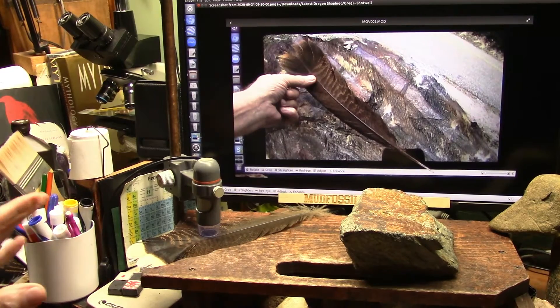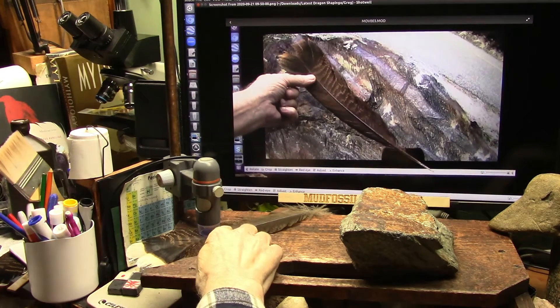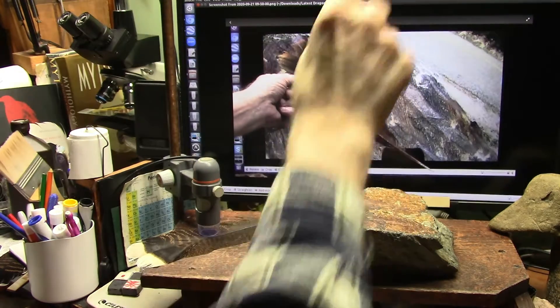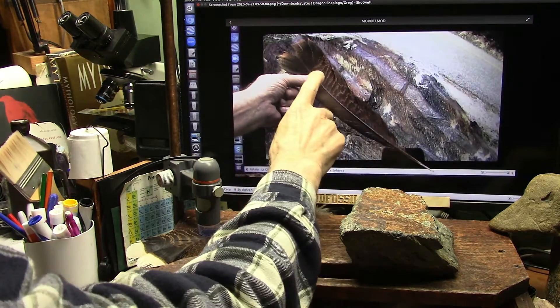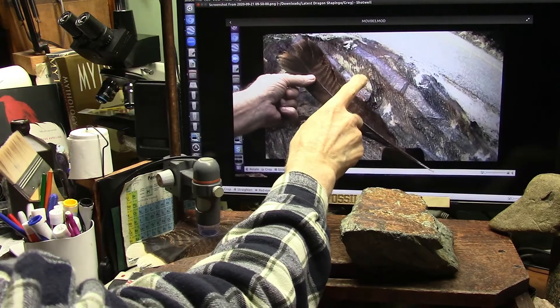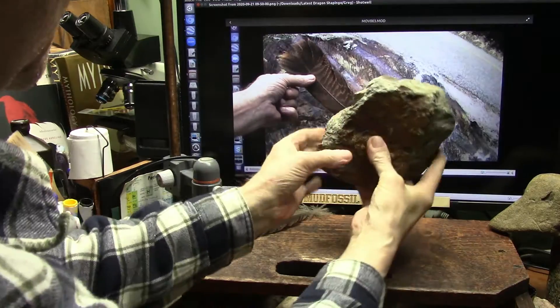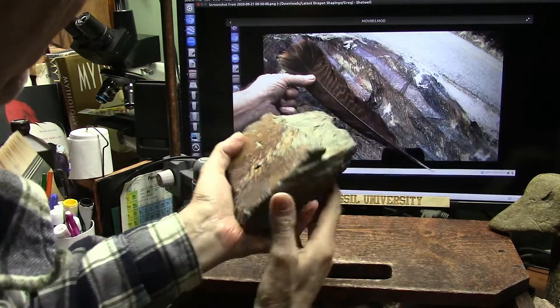All right, here's the setup. There is a turkey feather in the microscope. The microscope is up here. We'll be looking at it in a second. It's the same turkey feather I'm showing here up against this huge, huge slab of feather — this came right out of this little spot right here.